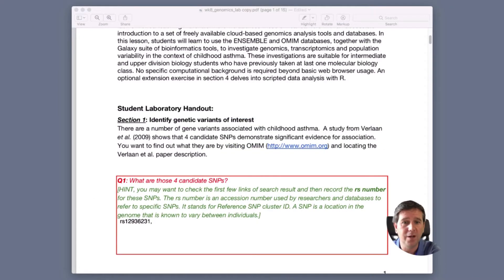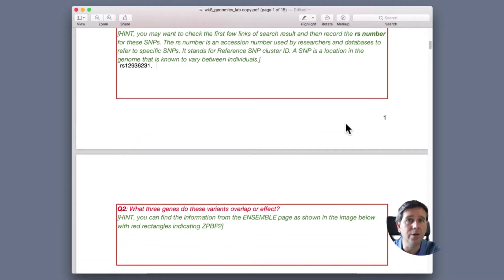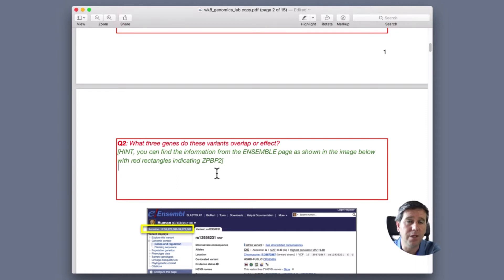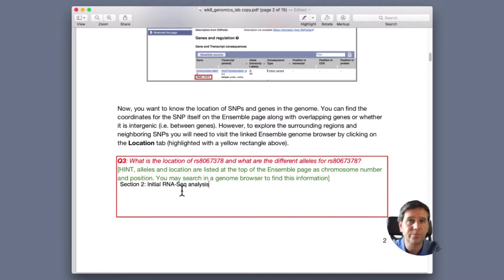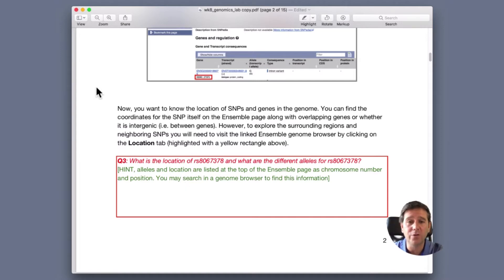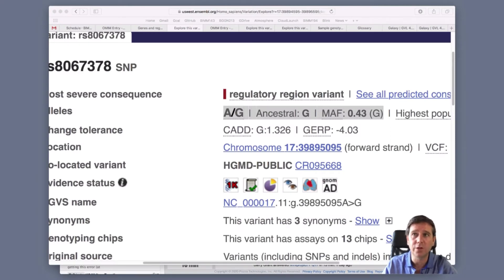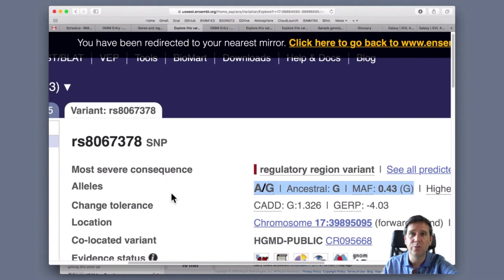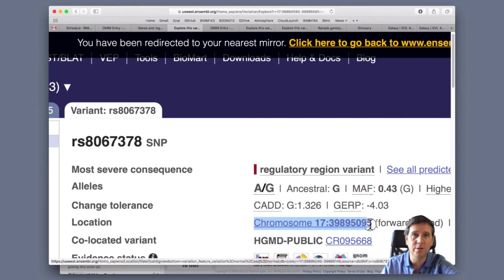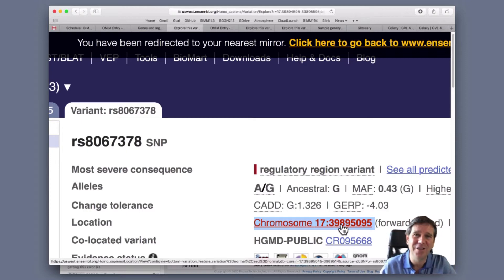That would be my answer to question 3 if we go back to the PDF. Question 3 asks for the location of RS8067378. The location, if we go back to the Ensembl web page, is chromosome 17. The coordinates on the forward strand are 39,895,095. Copy and paste that in - that would be your answer to the location.